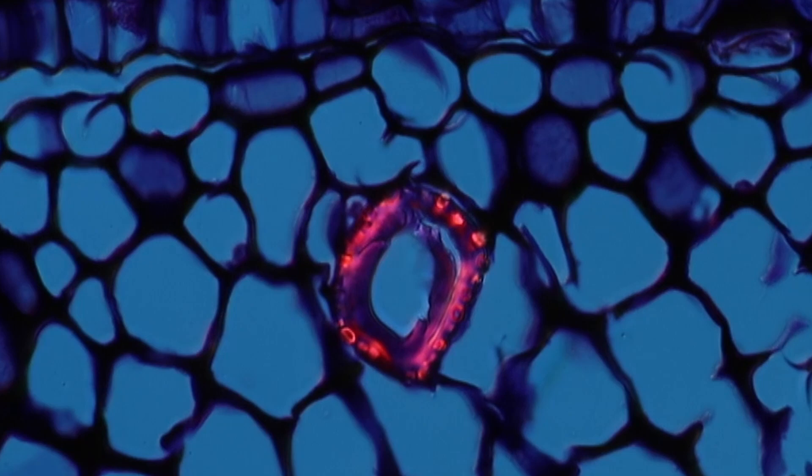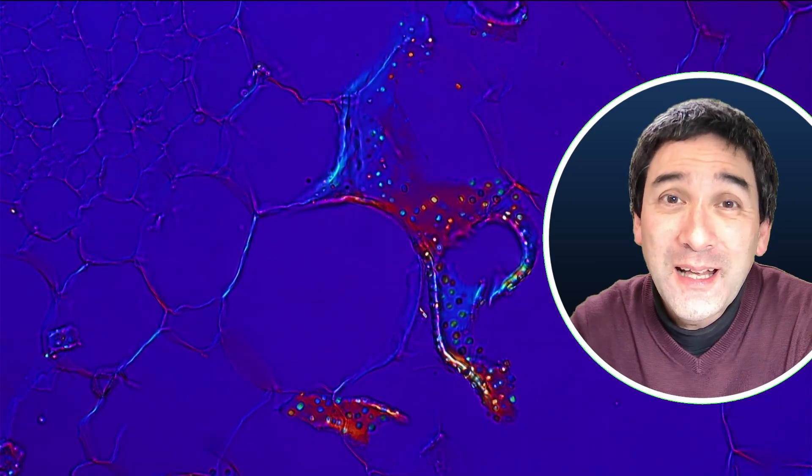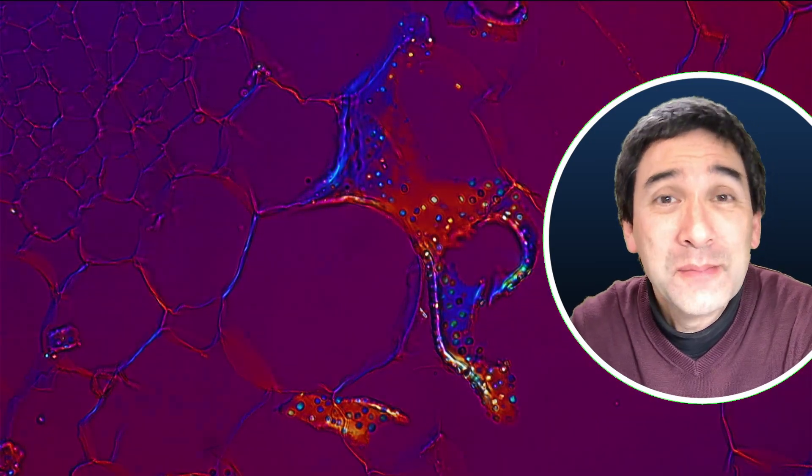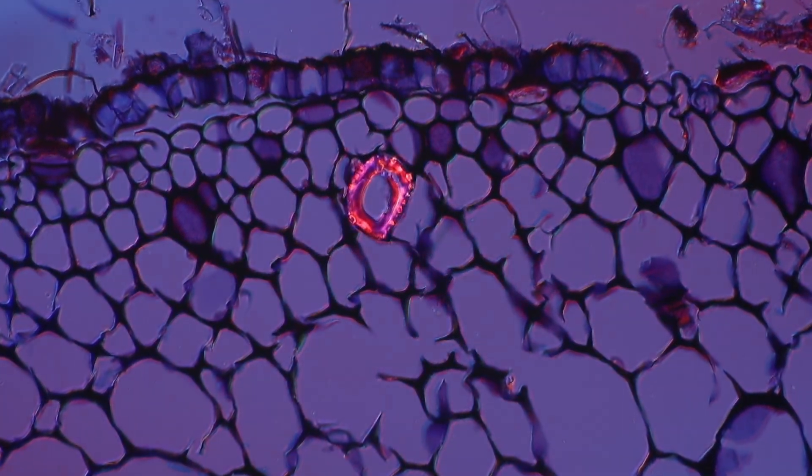If there's too much calcium, it's a problem for the plant. What the plant therefore does is convert it to calcium oxalate and store it in those idioblasts, so the calcium is not able to interfere with the metabolism of the plant cells. You see that sometimes those structures we're able to see don't necessarily have a function but are simply waste products.